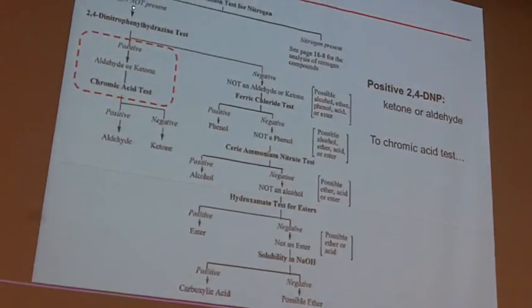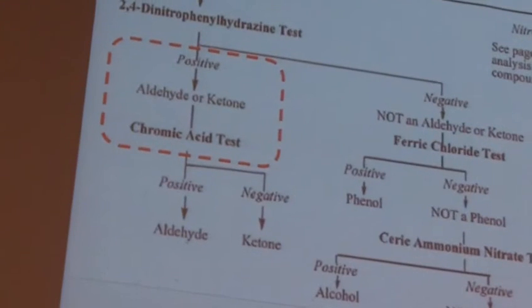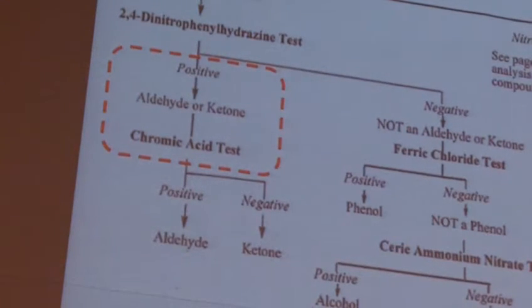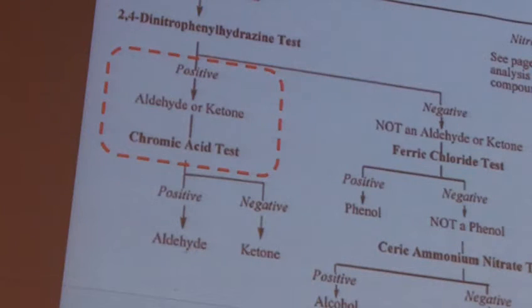From there, we've seen that test before. If that is positive, then you head down this branch of your flow chart. That means you have an aldehyde or a ketone present. As I mentioned, either of those functional groups will give you a positive result for your DNP. The next step then is the chromic acid test. The chromic acid test will define whether you have a ketone or an aldehyde. This is a new one.